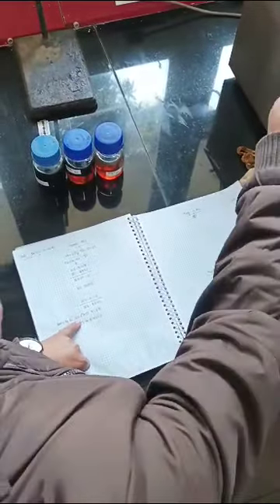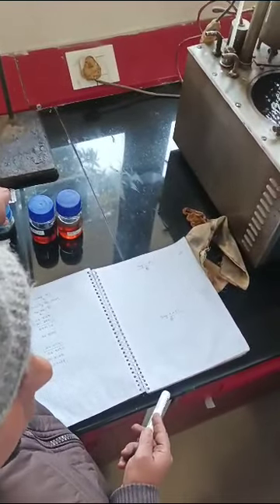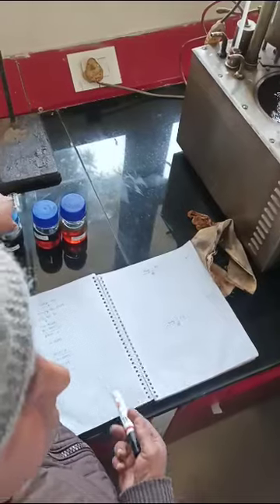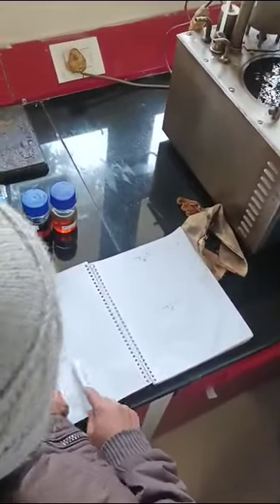At what temperature are you keeping it here? It depends on the condition of the sample. If it is VR, it may be kept at 100 or 75 degrees centigrade. But if the sample is in semi-solid form, we can keep it at 72 or 70 degrees centigrade. It depends on the condition of the sample. Okay, then you can convert. The density is 62.5, this much.